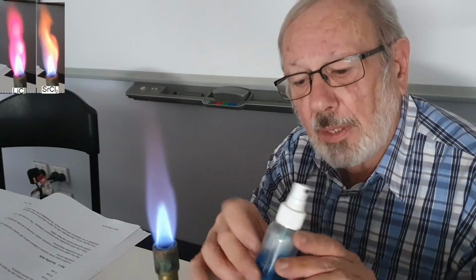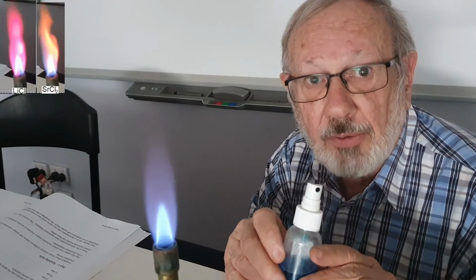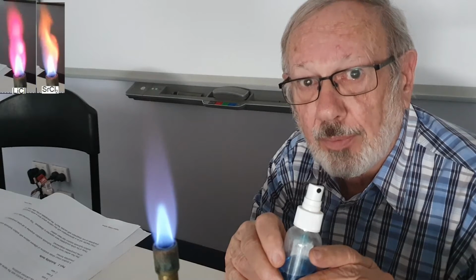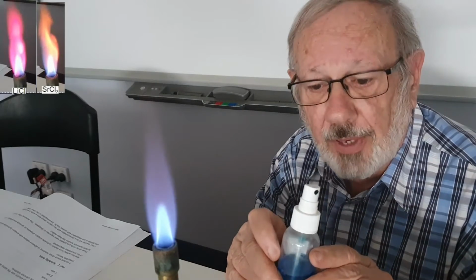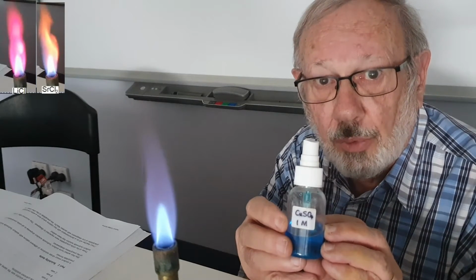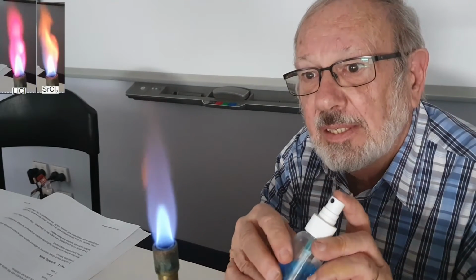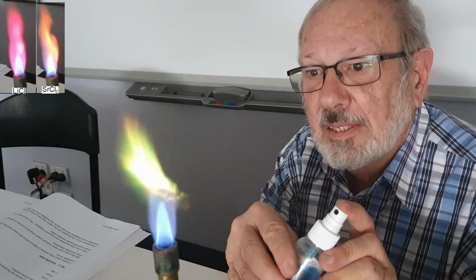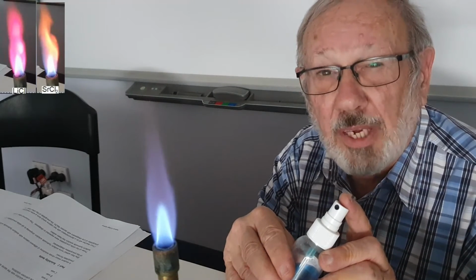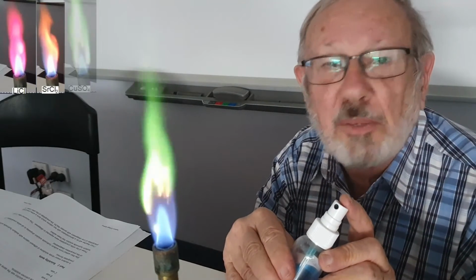The next one is copper sulfate. The strontium chloride, by the way, has the formula SrCl2. Our copper sulfate has the formula CuSO4. Let's see what colour it brings. Let's say we call that green. That looks like green to me.